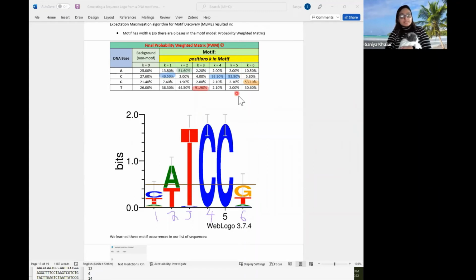And it does have a spread of the other bases as well. Whereas this one is split between A and T. Here it could be G, or T, or C and A. So the second base is not so likely as the second base here. That's why this is higher than this. It's like weighing how much information we know.